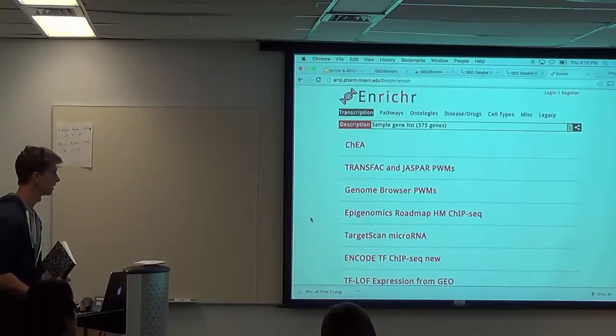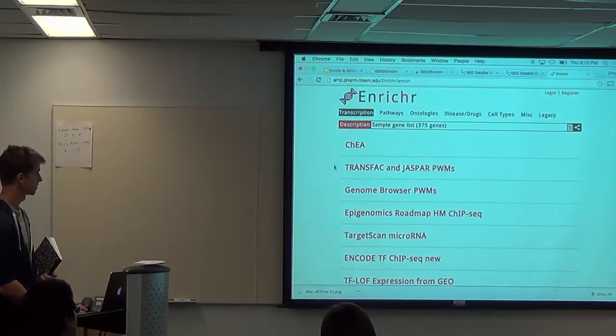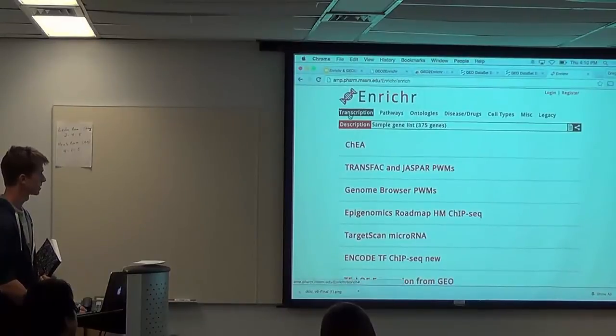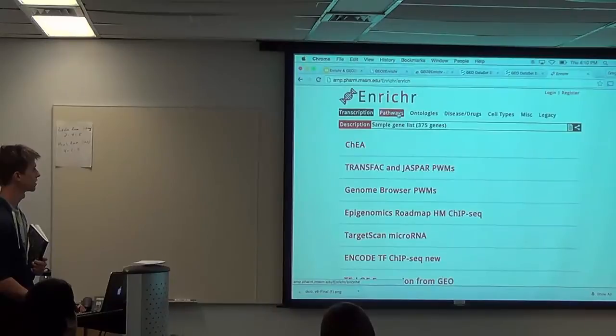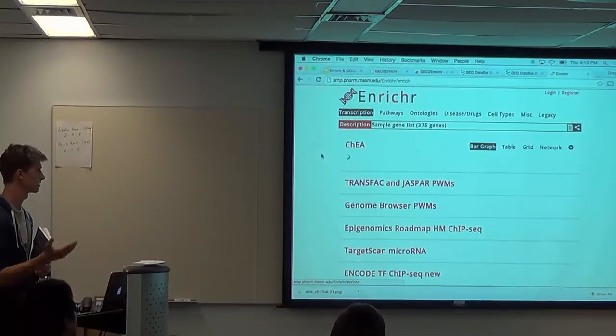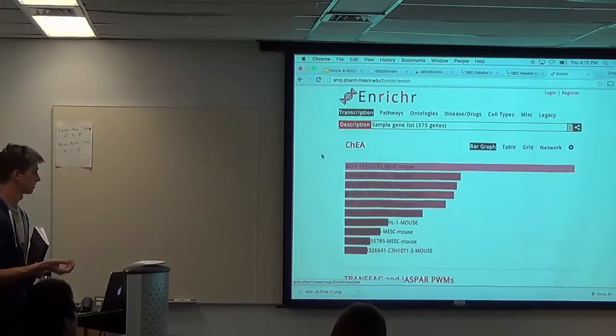So here's the results page. These are our gene set libraries listed here, and they fall under these categories. Right now we're under the transcription category, and we can change categories by clicking on any of these. If I wanted to see the results for the Chea gene set library, I click here, and that sends it off for analysis. It should come back.